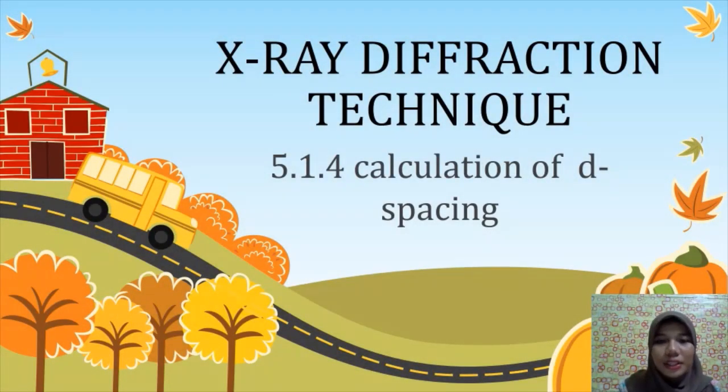Next, X-ray diffraction technique: calculation of d spacing. From Bragg's law, we know a crystal can diffract X-rays because the interplanar spacing in a crystal lattice is of the same order as the wavelength of the X-ray.